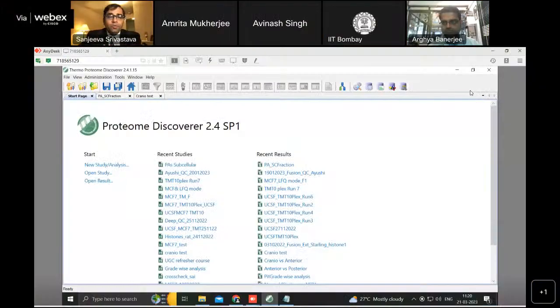But what you can generate is 3 types of information. One is you are looking for the viral infection and the viral peptides from the given sample. So we first searched against the SARS-CoV-2 database. Then additionally, we were also interested to know the host response. So we looked at the human proteins and the human proteome database. And now more recently, we thought about what was the environment or microenvironment which was affecting the individuals. So we also looked at the metaproteome of all the pathogenic databases. So think about it, the data acquisition was very straightforward, 2 hours. But now data analysis took several months of a lot of computing power to make better sense of this data. So all right, Arghya, very quickly you can give an overview of Proteome Discoverer.